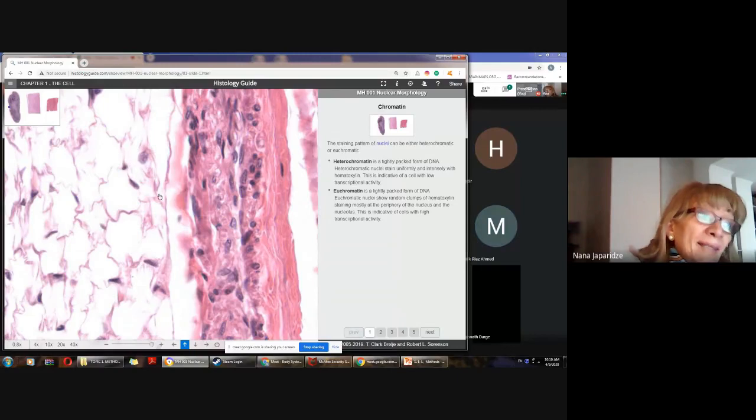This is white adipose tissue. These are cells too. Look, these polygonally shaped structures, which are not stained. These are cells, white adipocytes. This is nucleus of white adipocytes. Look, this dark stained. And what you see here is a small amount of cytoplasm which surrounds the nucleus and surrounds this whole cell together with the cell membrane.